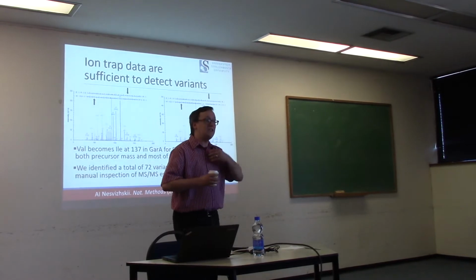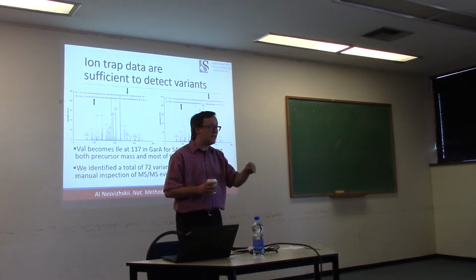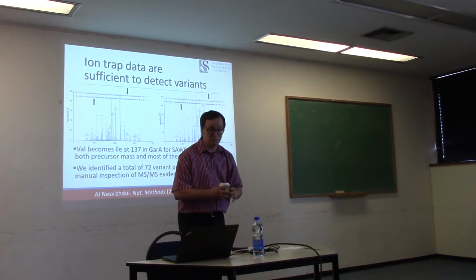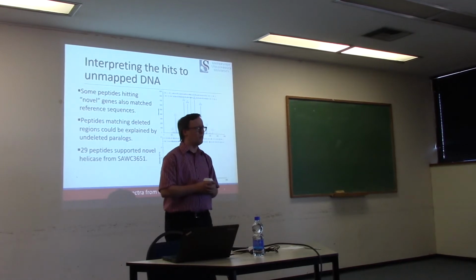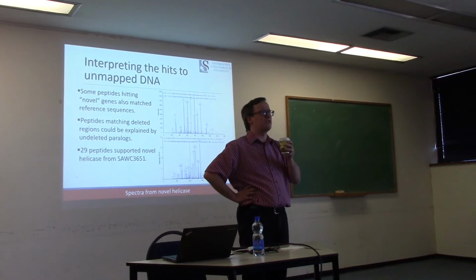So at base, we feel that we have very compelling evidence that we can recognize expressed genetic variation in MTB strains at the sequence level. So we felt very encouraged by that result. And so did our peer reviewers, which is always a good thing. So finally, what about all that unmapped six-frame translation stuff?